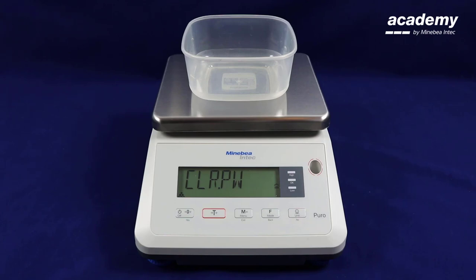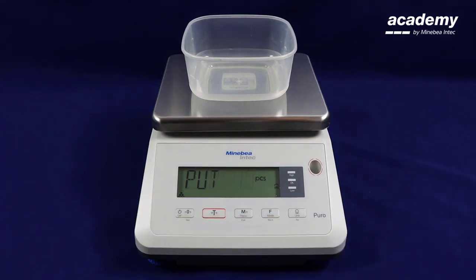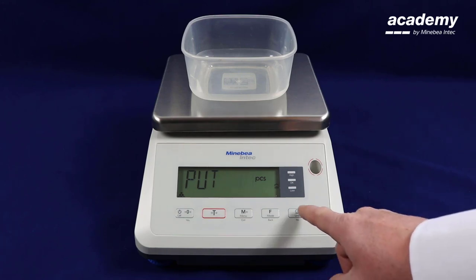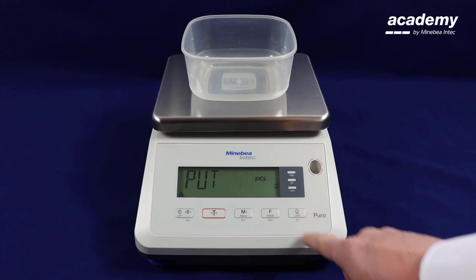On the screen it is saying to clear the piece weight. This is where you can set the different weights and number of pieces, or your reference sample. Here is where you select how many pieces are going to be in your reference sample. Using the no key, scroll up and you can see the different preset pieces requested.